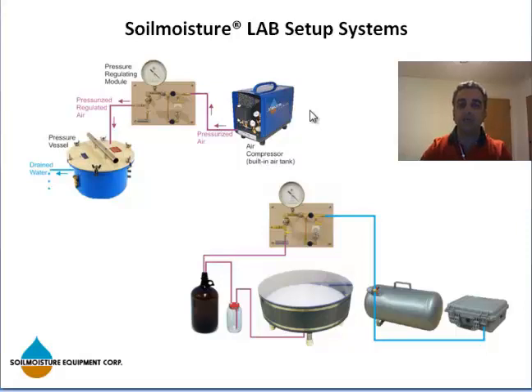Actually, our new compressor model 0500 has a much larger pressure reservoir that is a much better option for our users in future. It's going to be released in near future. You cannot see the air tank here, but it's built in 0505 compressor.